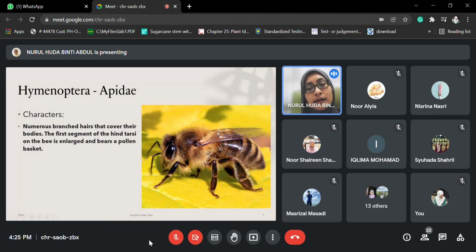And then I'm not sure whether you are familiar with this atau tak, but from this picture kita tak boleh nampak lah, but actually dia punya hindwing, okay, is quite small compared to the forewing, so it's almost like less than half of the size of the forewing. Sometimes ada yang a bit half lah, it depend on the species, but usually it's very small hindwing compared to the forewing. Forewing dia ni quite big compared to the hindwing lah.